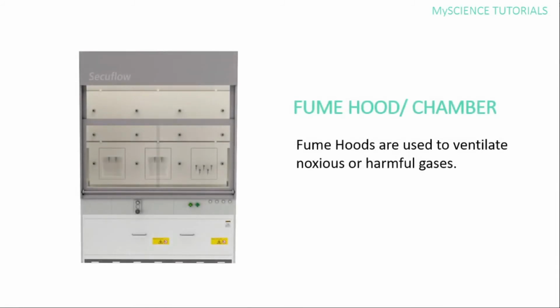Now, the fume hood or the fume chamber. The fume hood serves as a ventilator for noxious or harmful gases. When you are carrying out an experiment that involves the evolution or effervescence of gases, you need to make sure these reactions are carried out in the fume chamber. If you don't, these gases, as they come out, diffuse into the air and you are inhaling them. That will pose a problem in the future. For safety reasons, you carry these reactions out in the fume chamber.